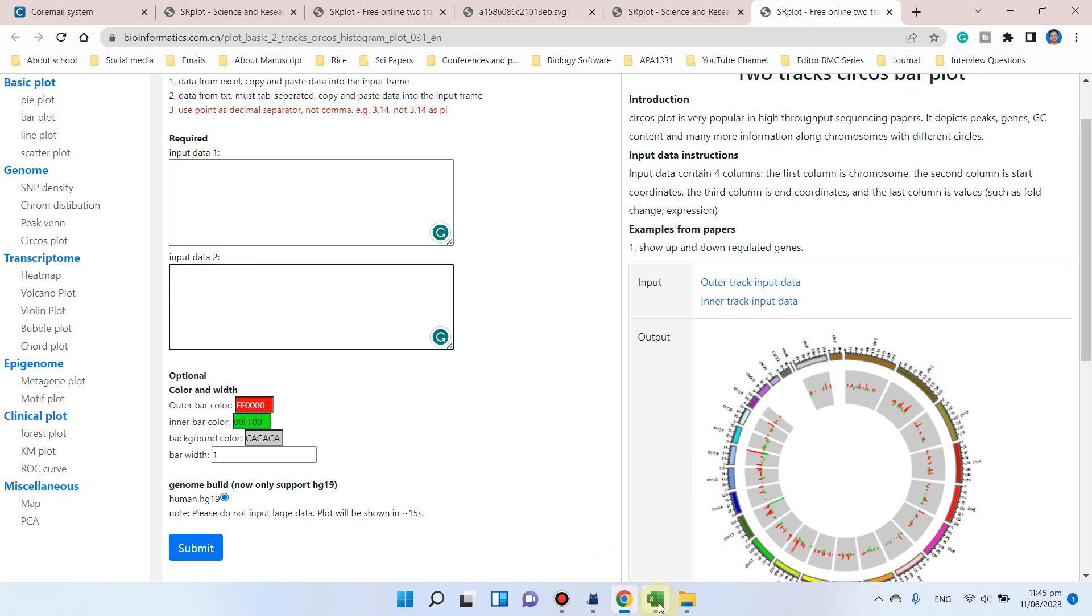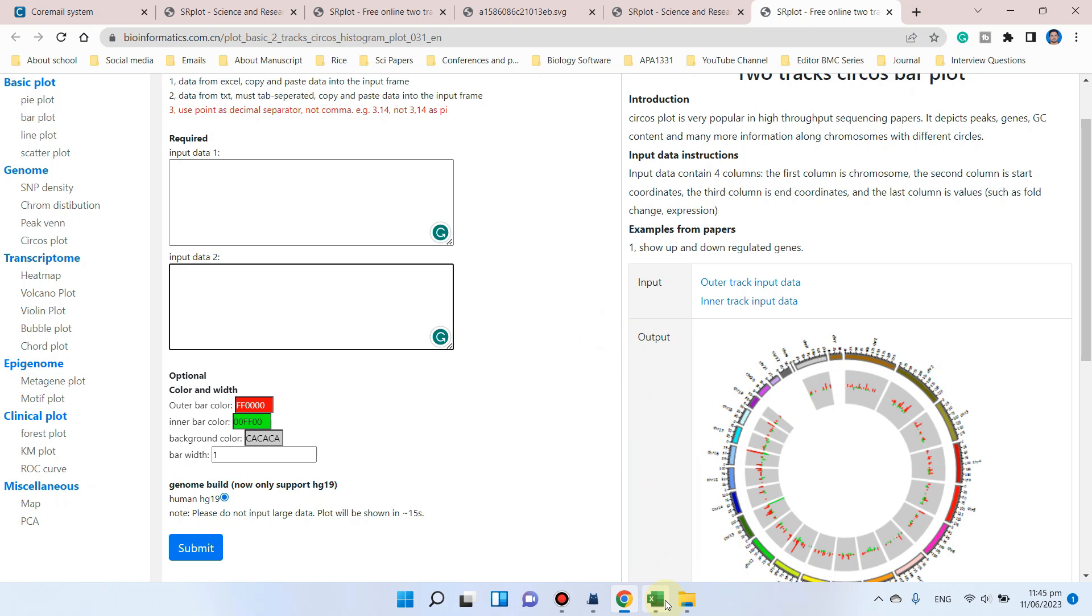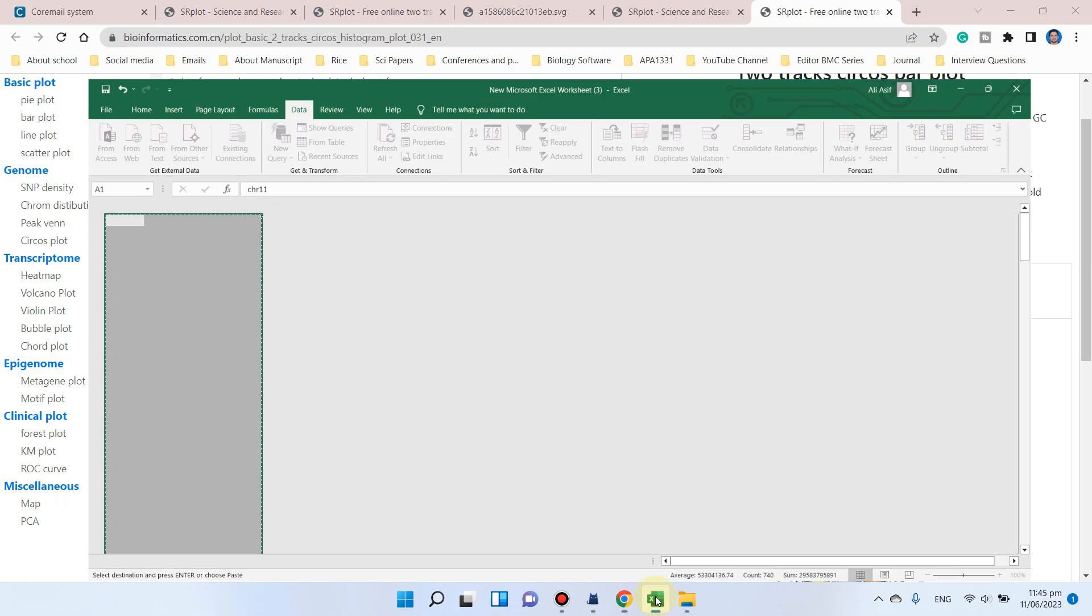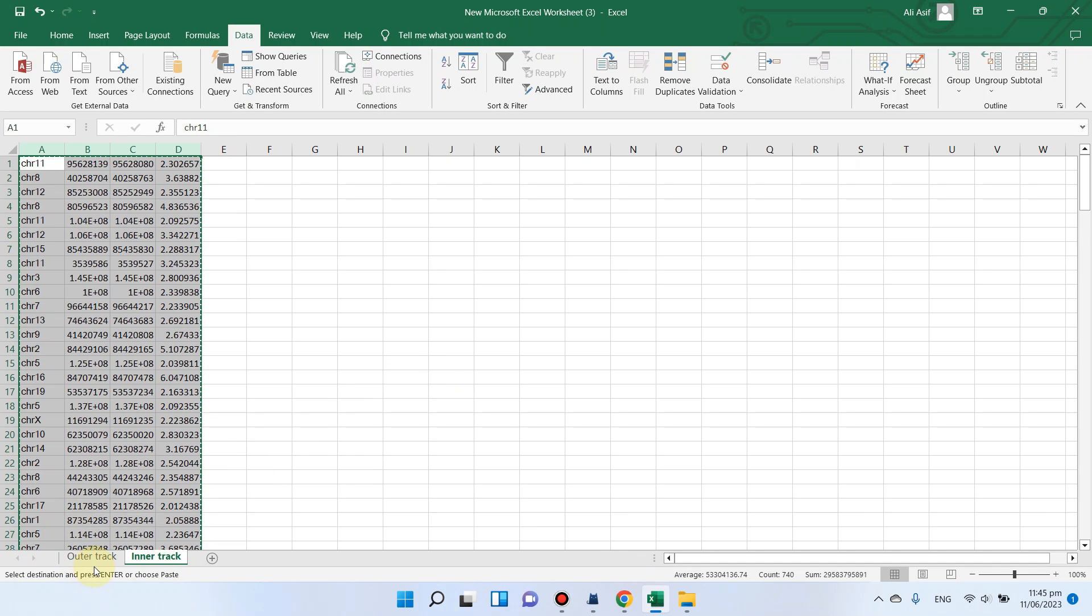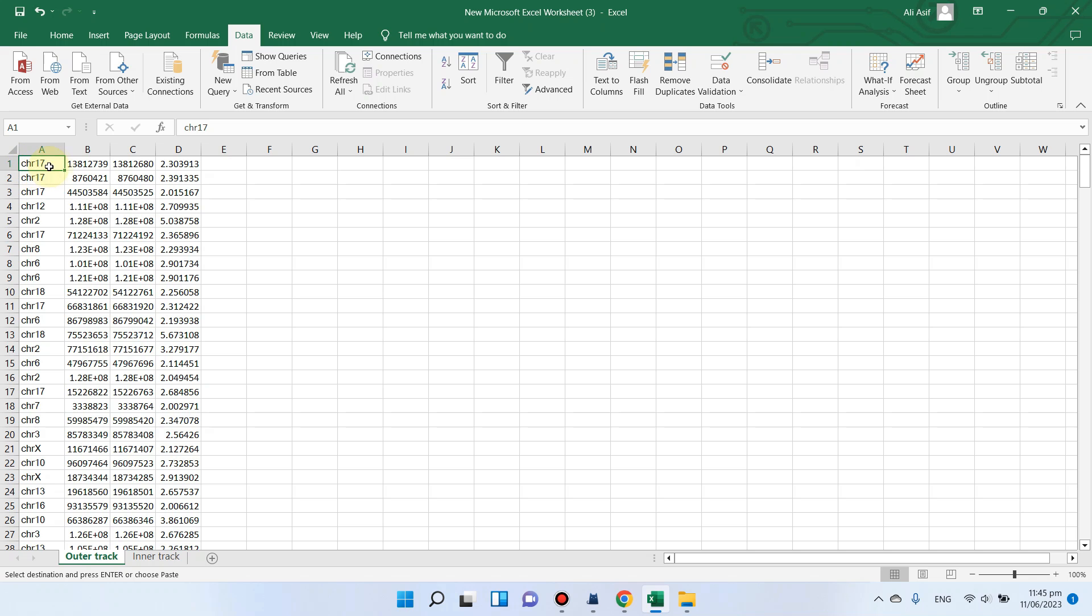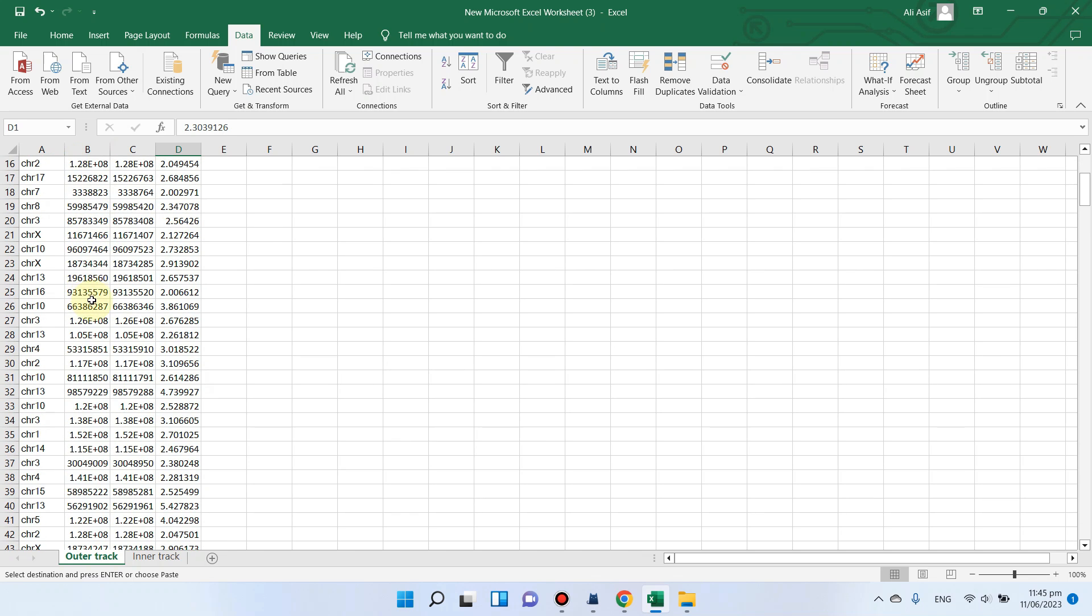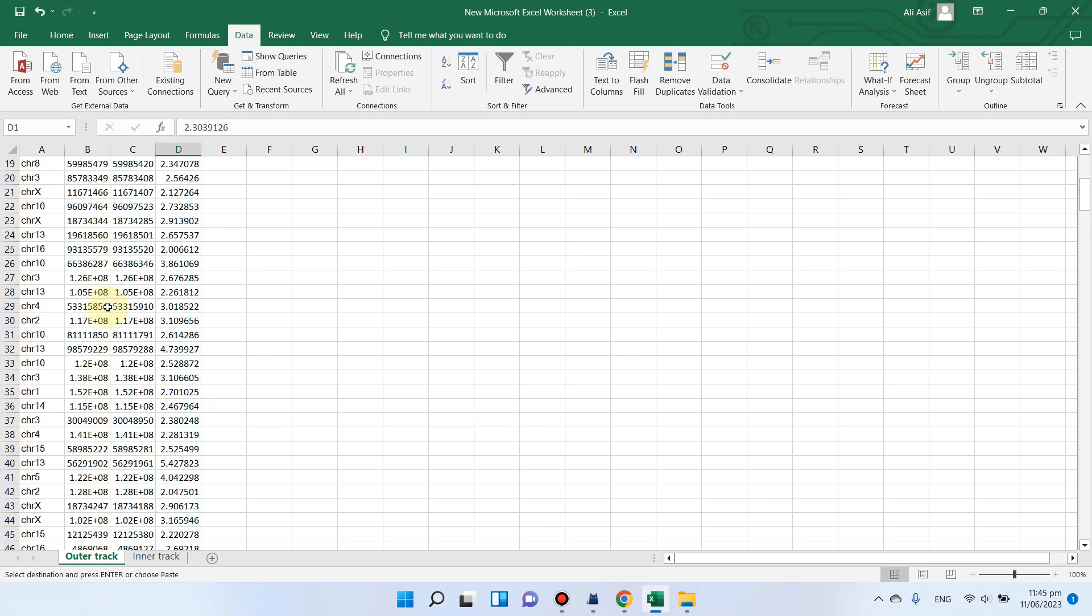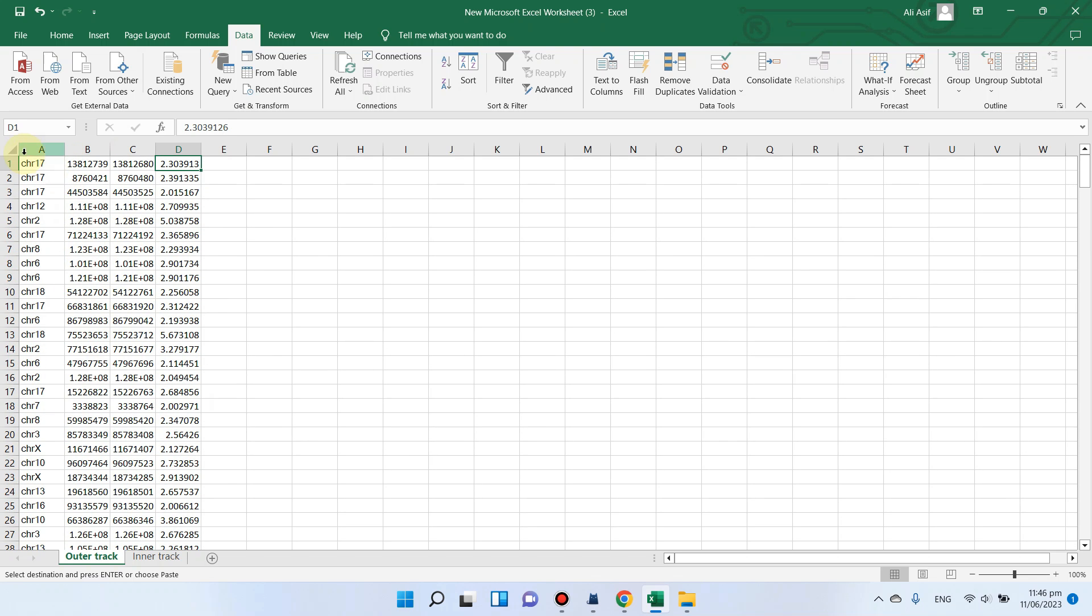Let me show you how you can prepare your Excel sheet to use and draw the data. I have drawn four columns. In the first column is the chromosome number. You can see there is no space between the chromosome number and chromosome letter. Here is the start position on the chromosome, here is the ending position of the chromosome, and here is the fold change.